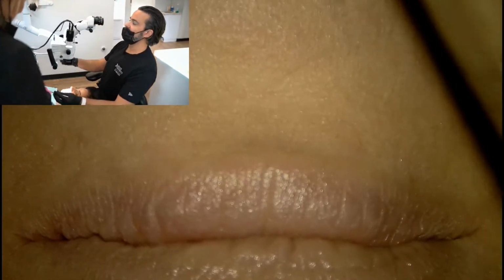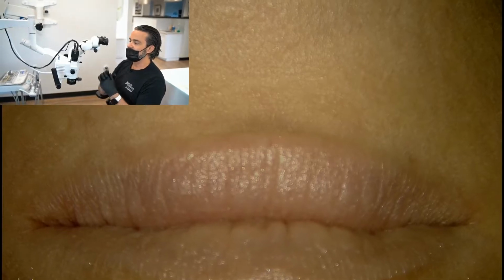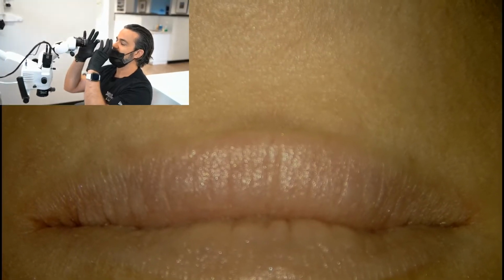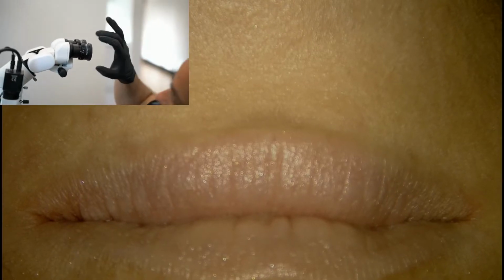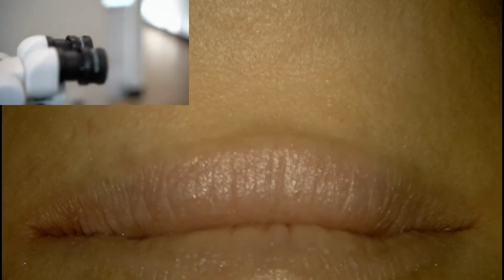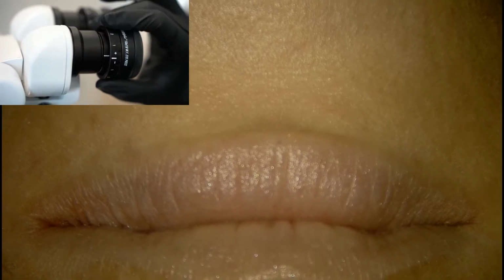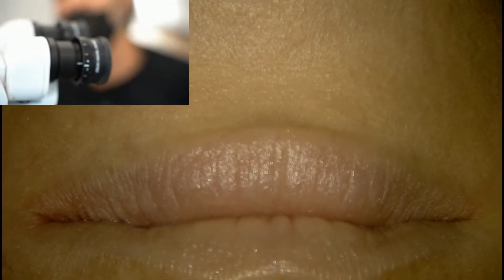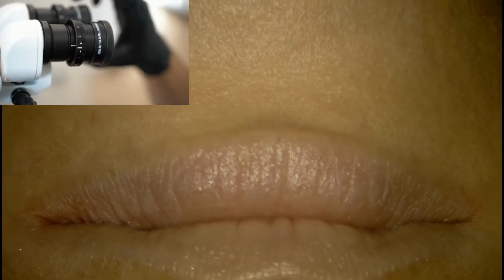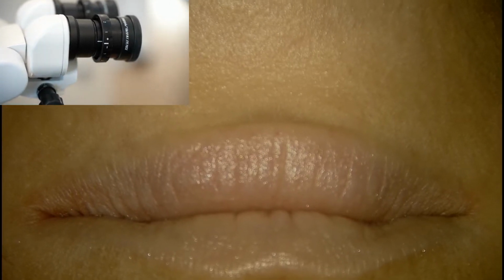Okay, so a question came up about touching the microscope. There's a couple things, and a lot of manufacturers do this part differently. It's the ability, if you wear glasses or contacts, if you have cups that come out. On the microscope, you can adjust your correction if you have corrections in each eye. This can give you your plus or your minus correction. My eyes, I don't have any correction, so I'll leave it on neutral, meaning there's no correction. The other thing is these eyepieces, on this brand, can come out. And there are different magnification levels that you can pick in the eyepiece that affect how magnified things are.